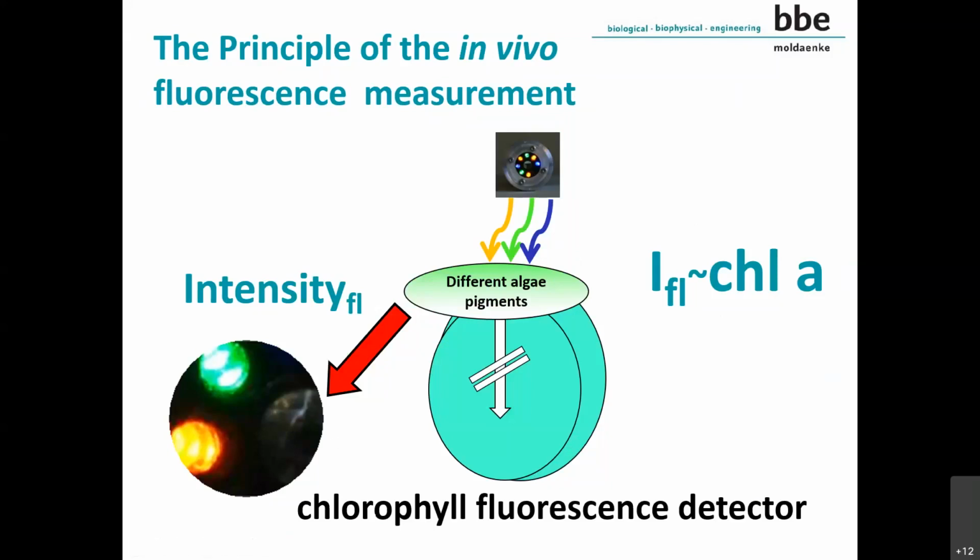And usually the algae use light to make photosynthesis, but when you have a very low amount of light and it is pulsed, as we perform this with the AlgaeTorch, then you can see that it cannot use this light for the reproduction, for the use of energy.